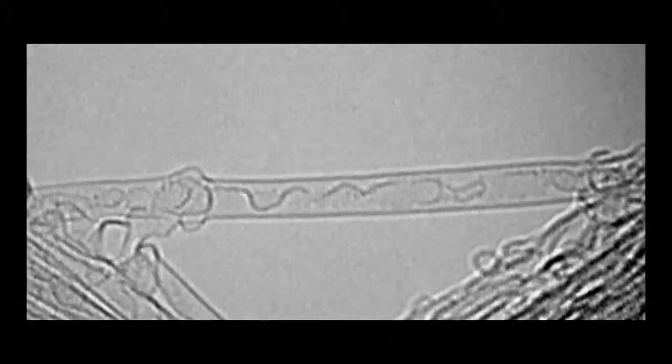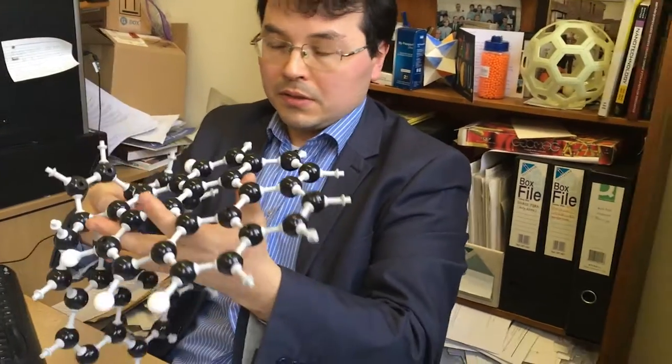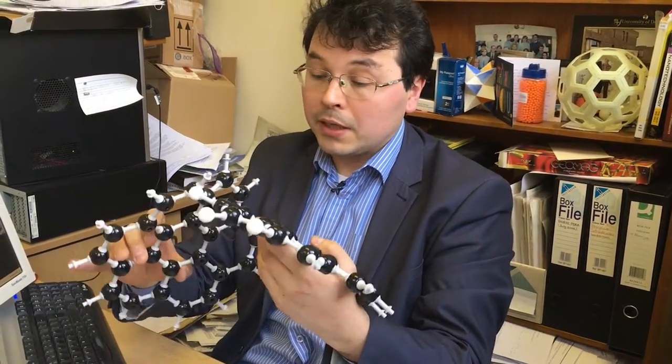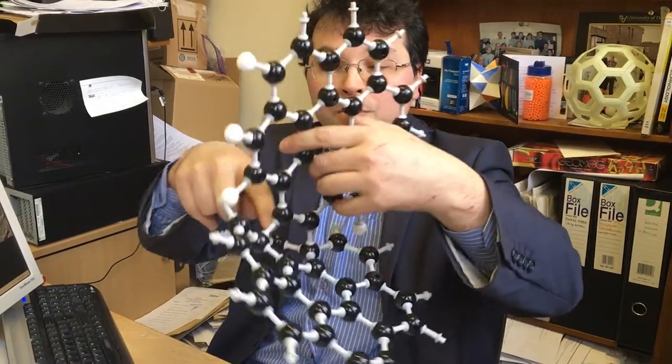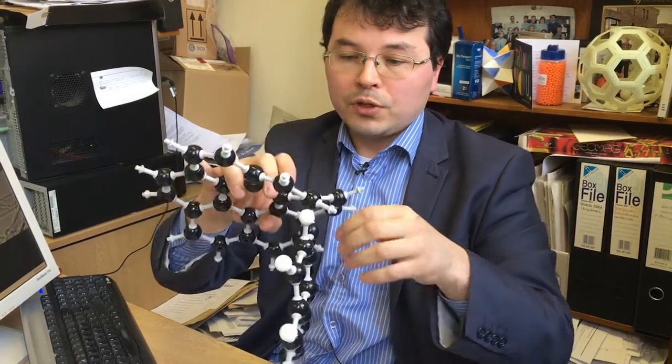But this is not the end of the reaction. This is just the intermediate of the reaction, something that is a transient species, something that is actually quite difficult to detect by any other methods. What happens with this intermediate is that obviously it still is exposed to the beam of electrons, and we start breaking bonds between the carbon atoms in this sort of bridging structure there.